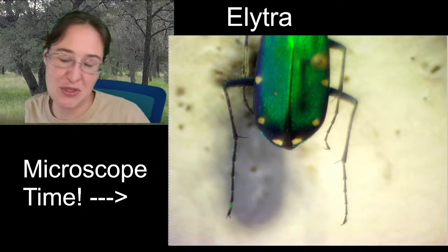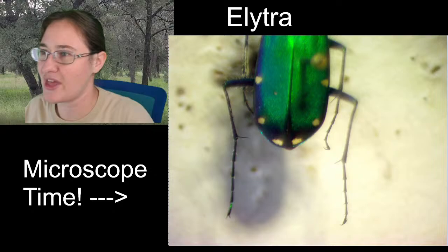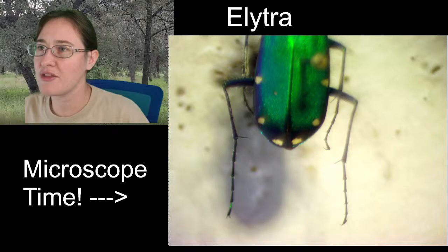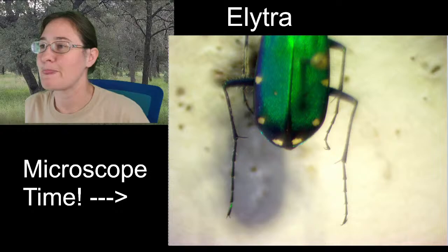Now, let me go ahead and look up tiger beetle tarsal formula, because I want to make sure we know exactly how many tarsal segments the front leg have. They are a 5-5-5 tarsal formula. So each one of their tarsi, their front, their middle, and their hind legs, they all have 5 tarsi. So if we are looking here, we can count 1, 2, 3, 4, 5, and then the two little tarsal claws. Perfect. We're going to zoom in.